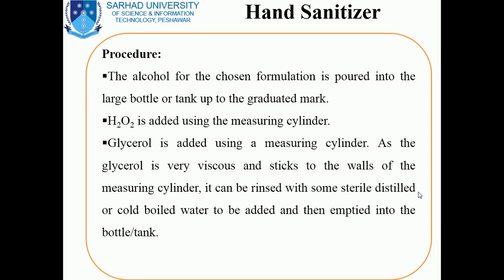We will add this water to rinse the walls, because glycerol is very viscous, and due to its viscosity it will stick to the walls of the measuring cylinder or graduated cylinder. In this case, rinsing will be necessary to transfer all the glycerol to the final bottle or the tank.